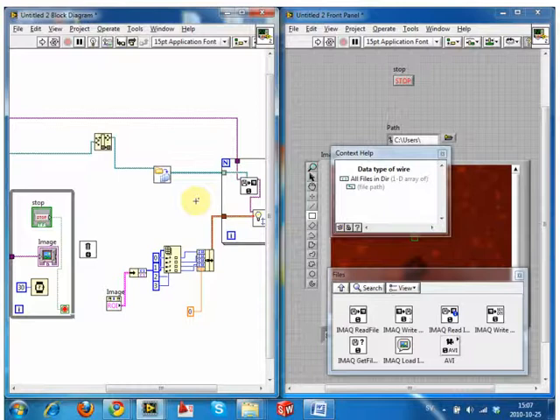Sometimes, if you've got two arrays with different data in, you might want to run them all together, and then when one finishes, just put a value of 0 in. So you can put a condition in there that says once the loop number is as big as the array size, the value now equals 0. You can put a little Boolean function in there to allow it to run arrays of different sizes.